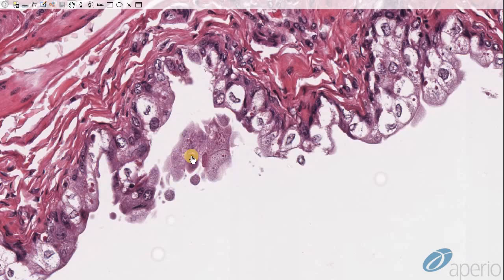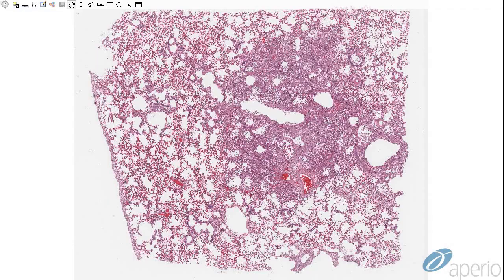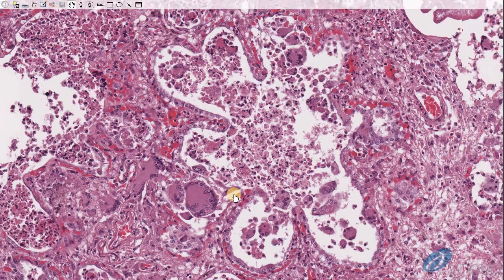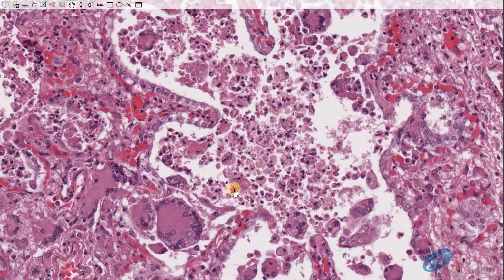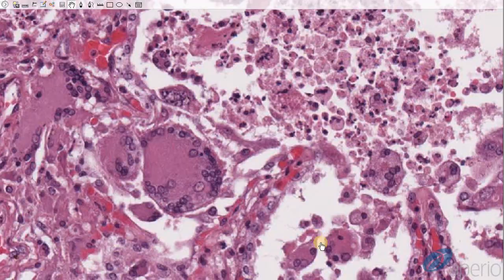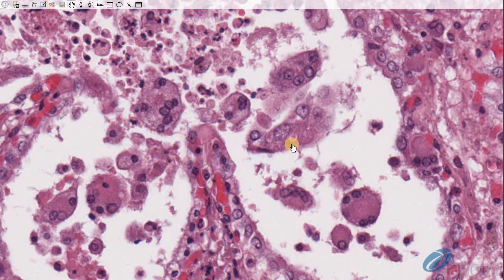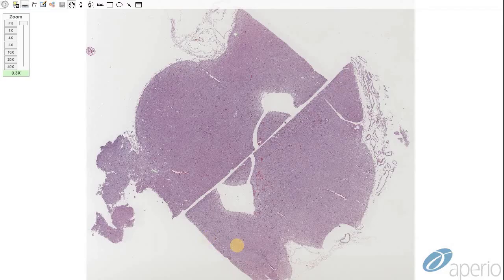This is a lung from a dolphin. We can see a large area of necrotizing pneumonia with numerous viral syncytial cells, and if you look closely, intracytoplasmic inclusion bodies and possibly intranuclear inclusions as well.